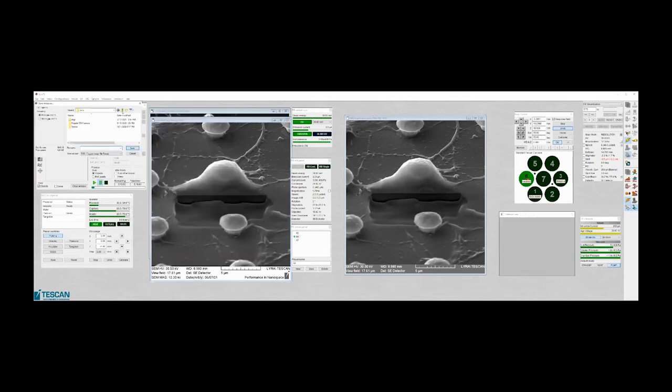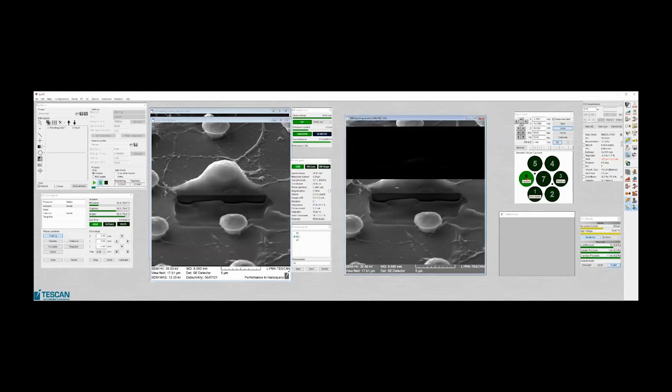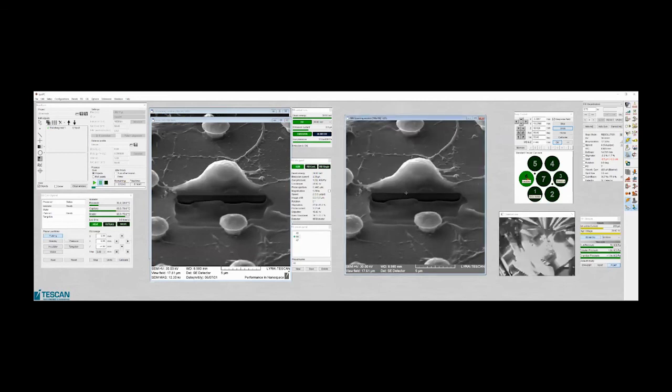Okay, so let's save it somewhere. Okay, now we can continue. Let's check it. Any difference or not yet? Maybe I will run it a bit longer.